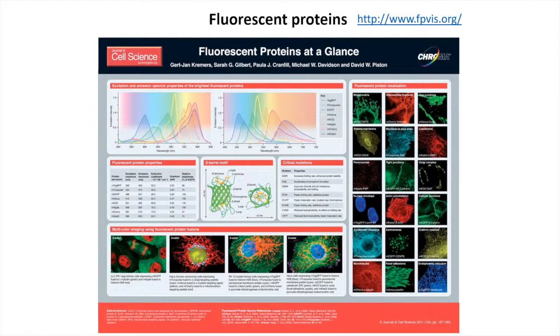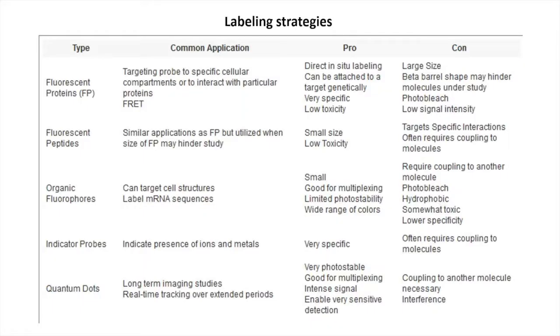So you have spectral overlap and bleed-through. Trying to do multicolor imaging, essentially 3 to 4 colors, 4 colors would already be pretty challenging because of this limitation of spectral bleed-through. So in that regard, hats off to the flow cytometry folks for doing 16 colors and whatnot. I don't know how to do it.